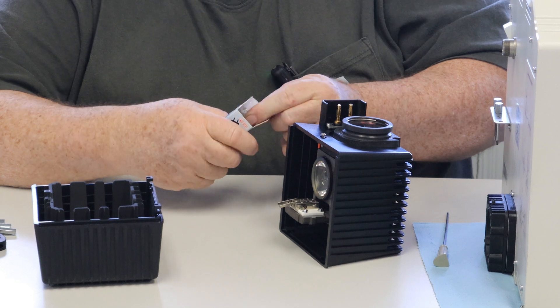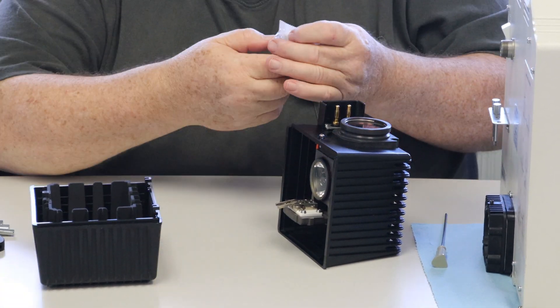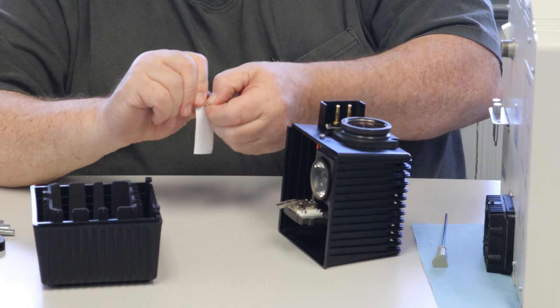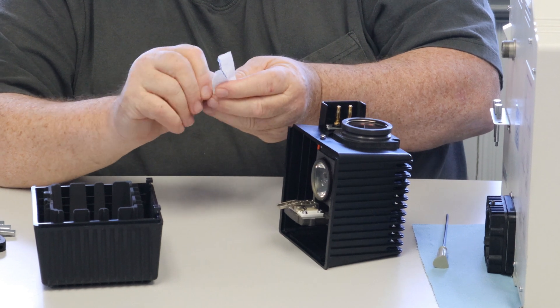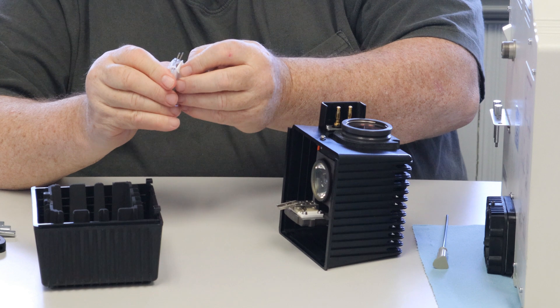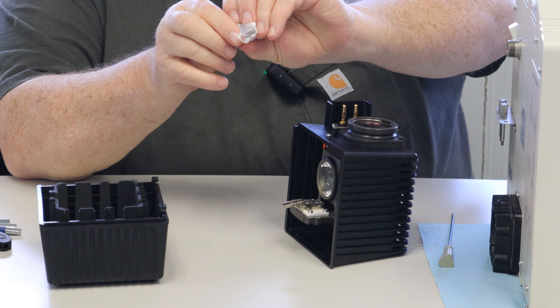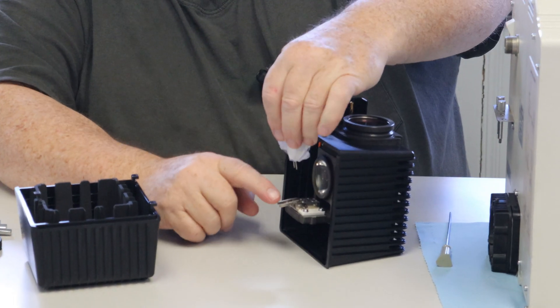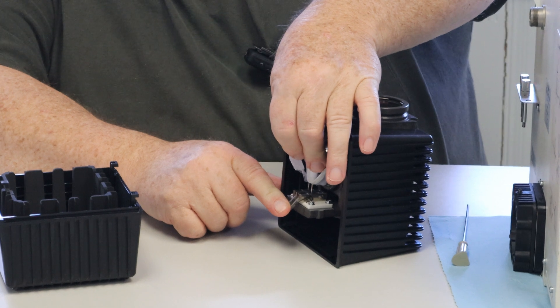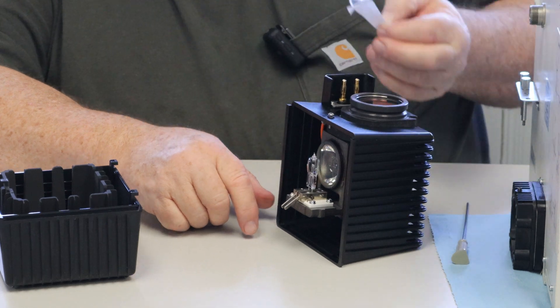We use the Osram 64625, 12 volt lamp. It comes in a nice little handy package that you can tear open and reveal the prongs or rods or plugs. This keeps your fingers off the globe. Then push down, plug in, and the paper comes right off.